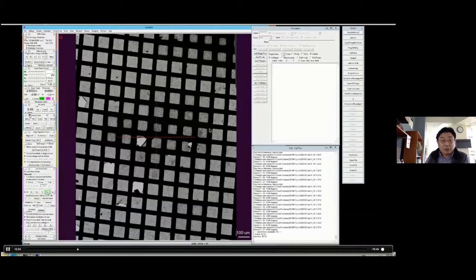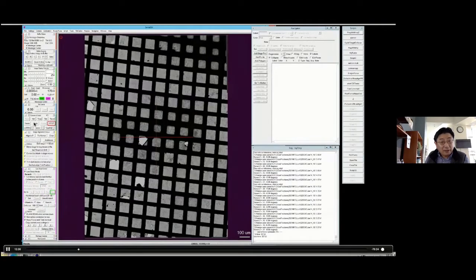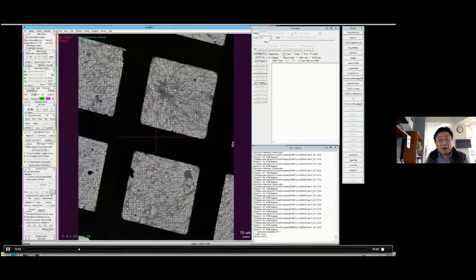We switch back to the other K2 computer. And this is very important. This is called search. It's basically low mag. I don't know exactly how much the mag is, probably 50x, because at 50x, you get this picture. So they are taking pictures. This is an old picture from before. Now you're getting this low mag picture.